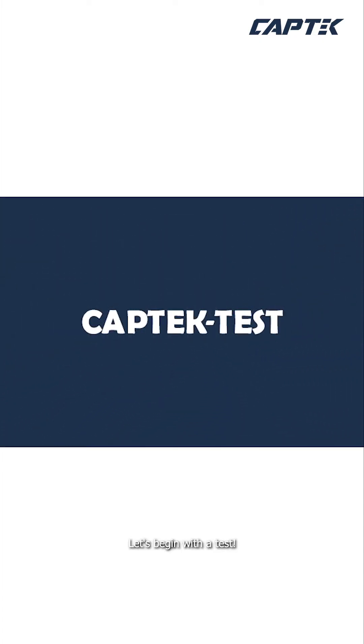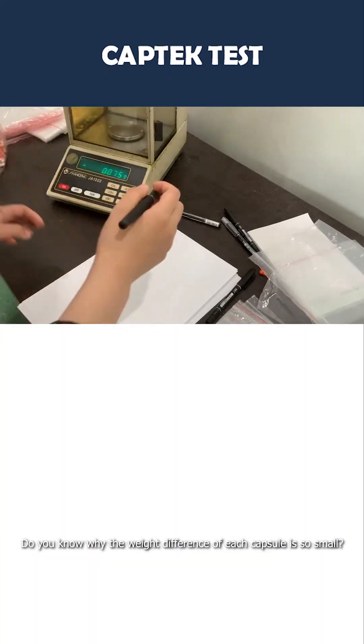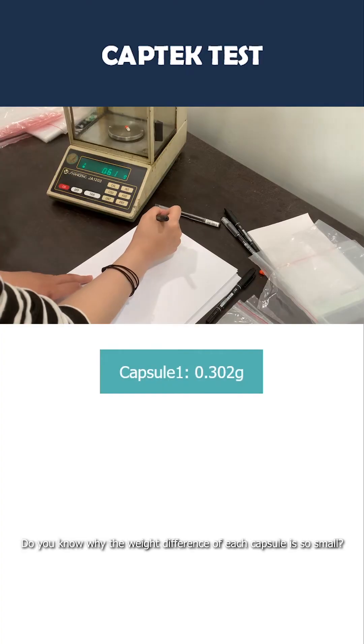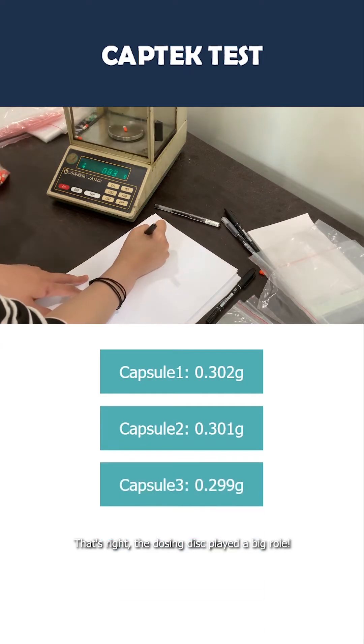Let's begin with the test. We start by weighing the capsules to check for dozing accuracy. Do you know why the weight difference of each capsule is so small? That's right — the dozing disk played a big role.